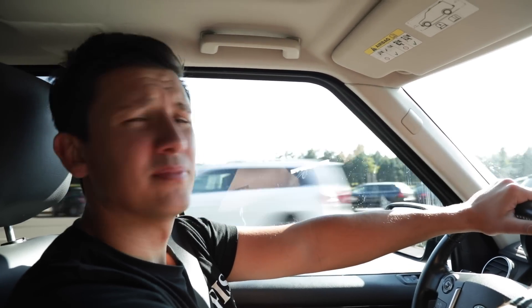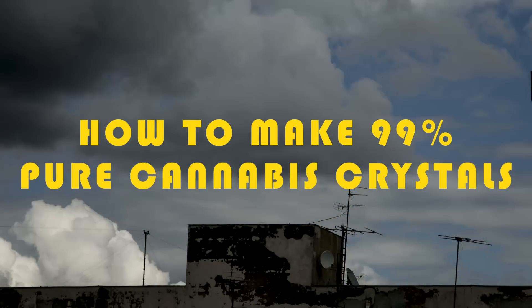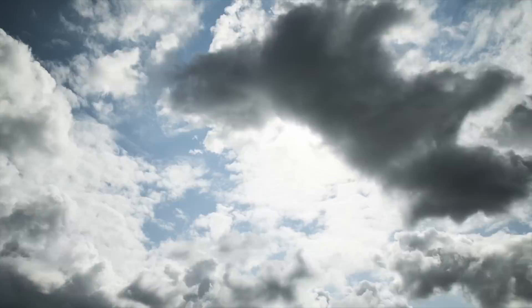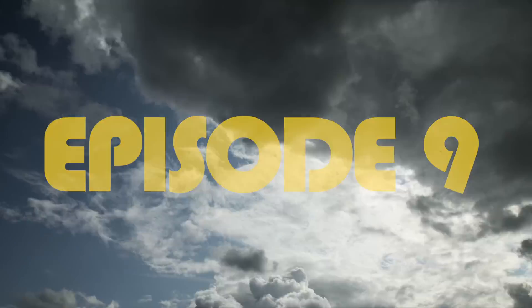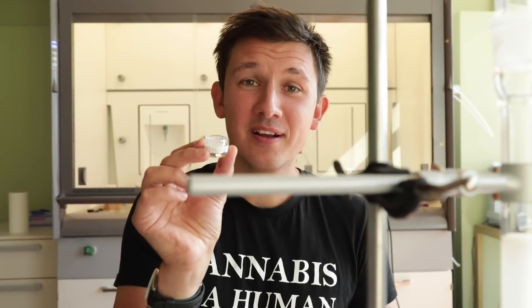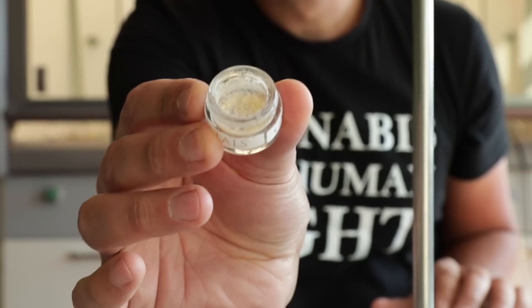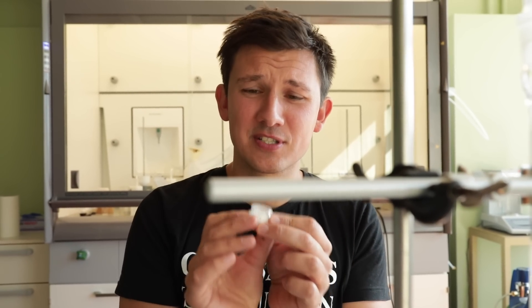Today we're going to the labs to see how we can make crystals and other interesting things. I'm going to show you how to make pure 99% cannabis crystals. It doesn't matter if you make THC or CBD — it's the same process. Here we're making CBD right now in the lab.